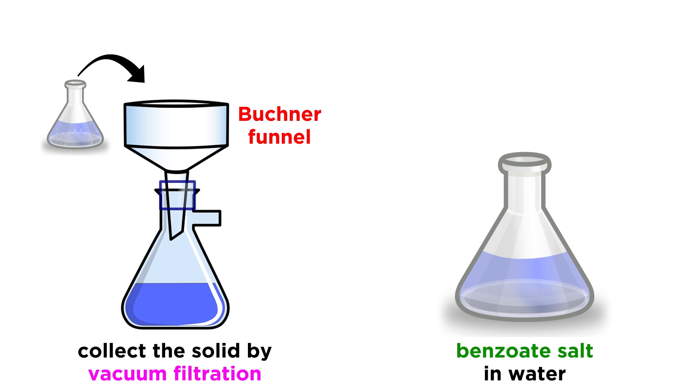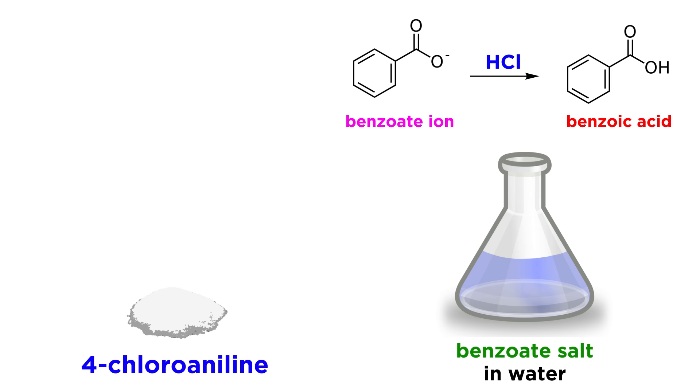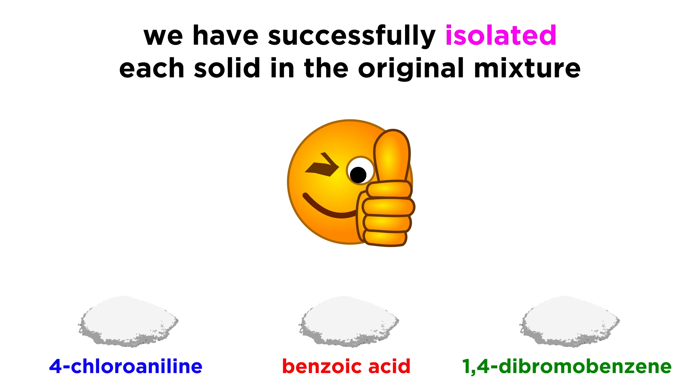Then we can do the same thing with the benzoic acid salt, except here we need a strong acid to protonate it. So to this flask, let's add some HCl, watch benzoic acid precipitate, check for a pH of around 2 to ensure that this is complete, and then collect that in a Buchner funnel as well. And there you have your three solids completely separated.